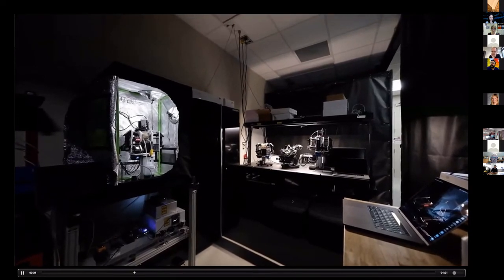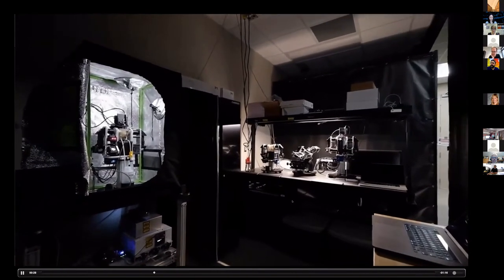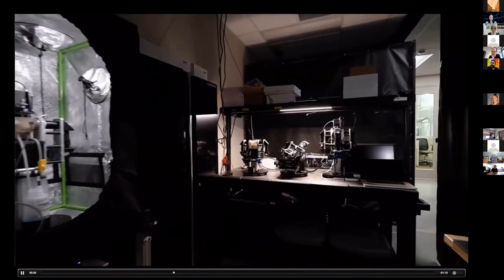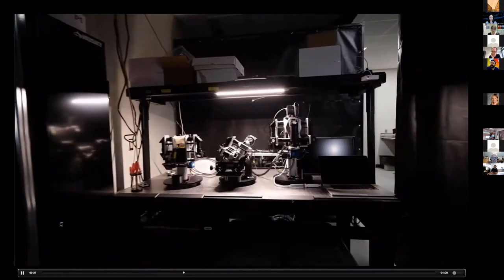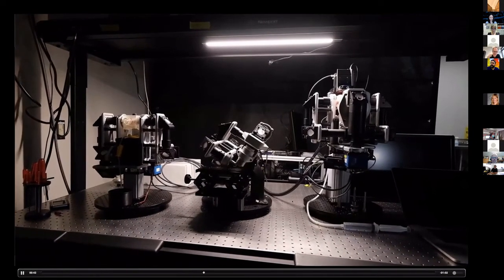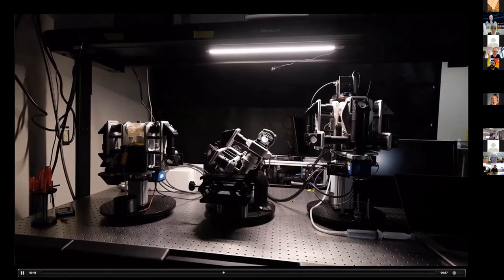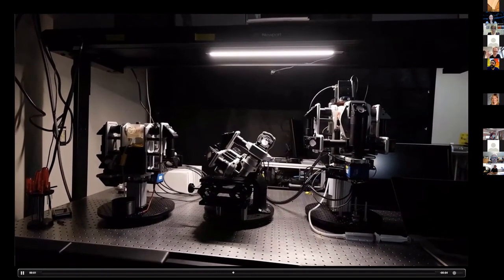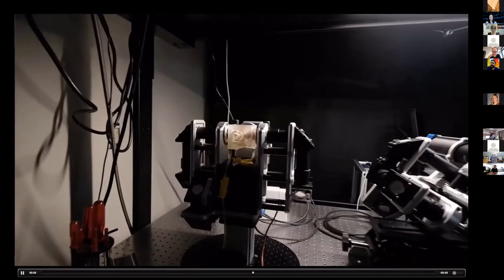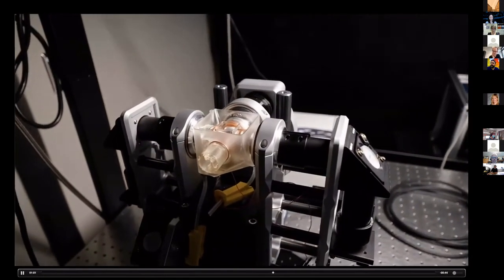And the neat thing here is, again, that you can use different configurations, and you can also build all of these configurations for relatively small amounts of money. And you can reserve the expensive components for whatever system you actually want to use. So basically, you can come in the morning and say, all right, today I want to use this configuration with these lenses. And all you have to do is attach a camera, plug in the fiber, and attach the stages, which are the 3 most expensive components. And then the rest of the instrument is already there, ready to be used.